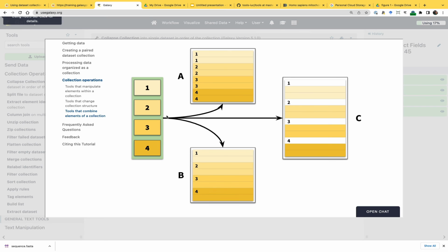I can prepend the sample ID to each row in the table, or, for example, if I output FASTA files, I can just print an extra line above each block. So there are different ways in which I can do this. But what I'm interested in right now is this: I merge them all together, but I add a separate column which provides an identifier. So then when I load it to Excel or Jupyter, to Pandas or R or whatever else it will be, I know what is what.